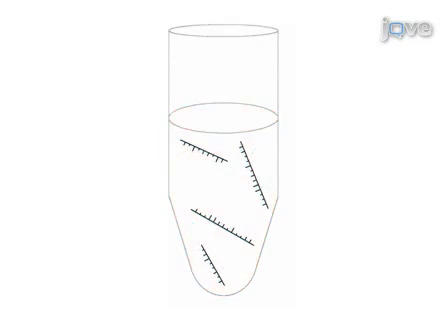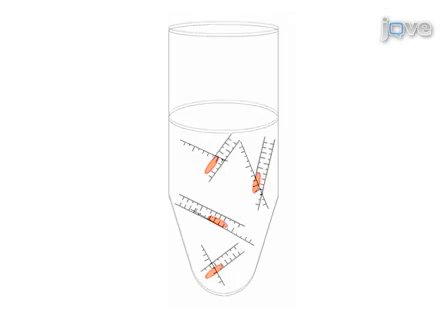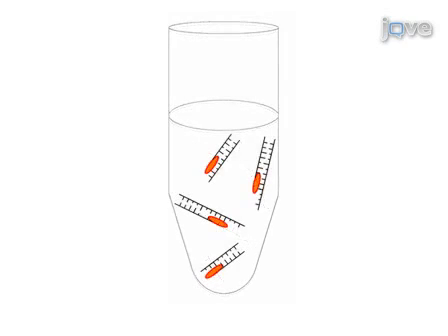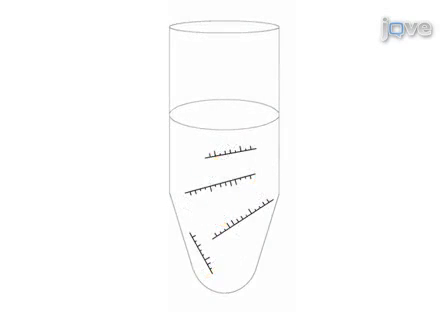The RNA is then cleaned and purified using the Qiagen RNeasy mini-kit to yield high quality non-degraded total RNA. For future applications and long-term storage, the RNA is synthesized into the more stable cDNA product. The cDNA is purified to remove the original RNA template strand.